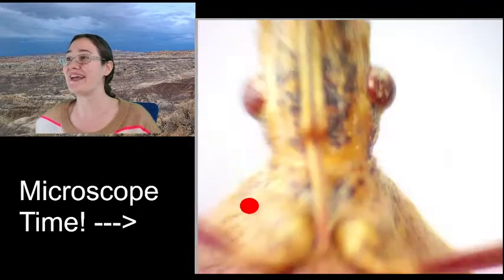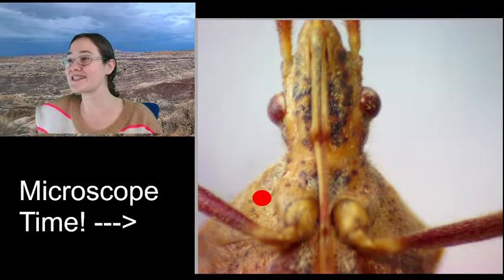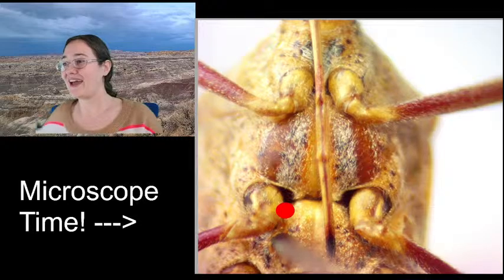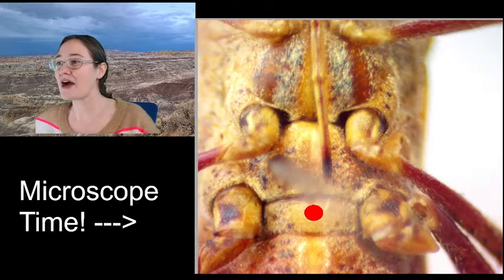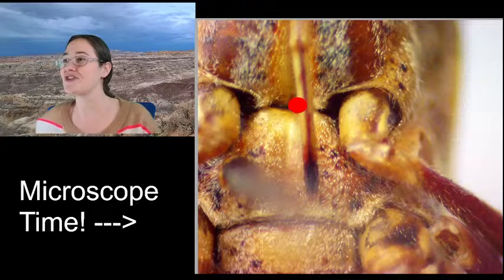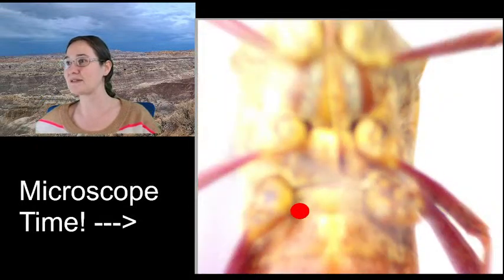So now that we've zoomed in all the way, let us see how long this mouth part is. Because it doesn't stop here between the first pair of legs. And if we go all the way, his mouth part, we've got a little bit of a shadow from the pin here. But his mouth part continues all the way to in between where the second and the third pair of legs come out of the ventral, come out of the bottom side of our buggy friend.